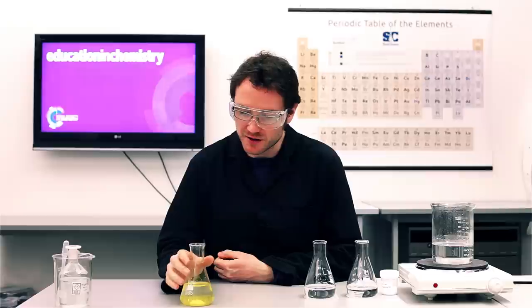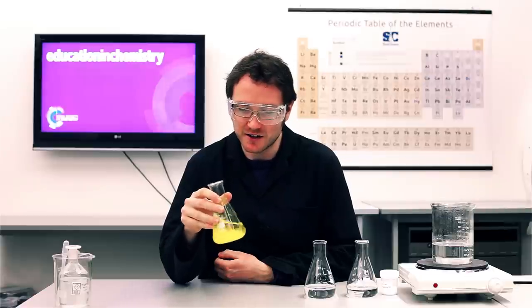It's the middle of winter here this month, so I have a wintry golden snowstorm to share with you as we precipitate out lead iodide in the demonstration often called golden rain.